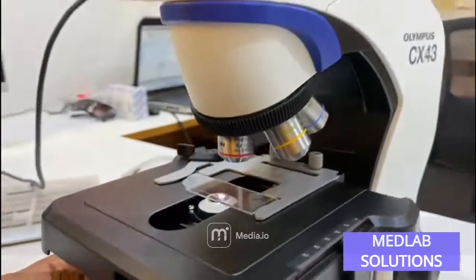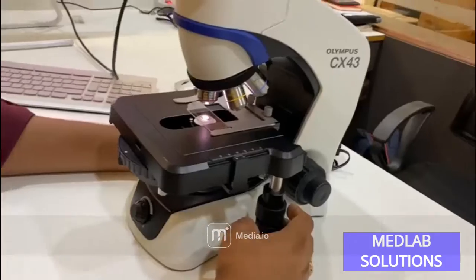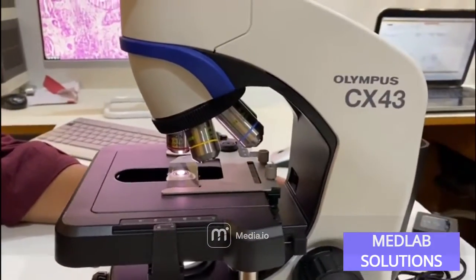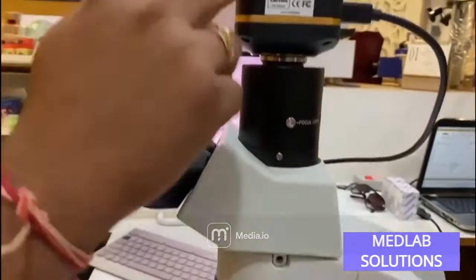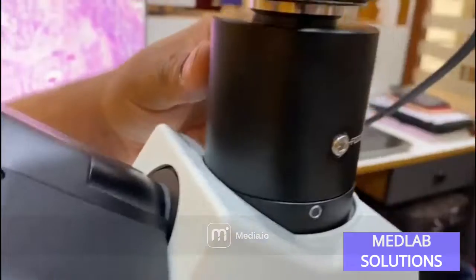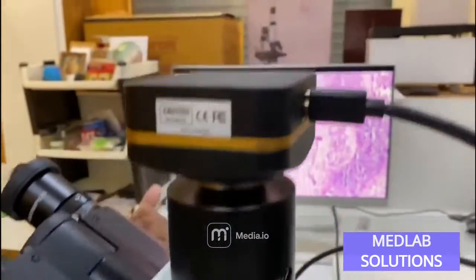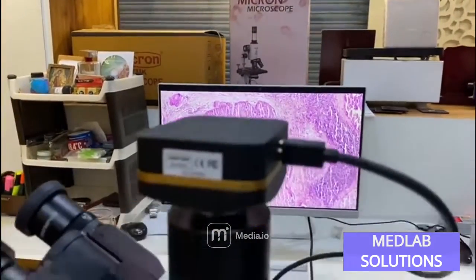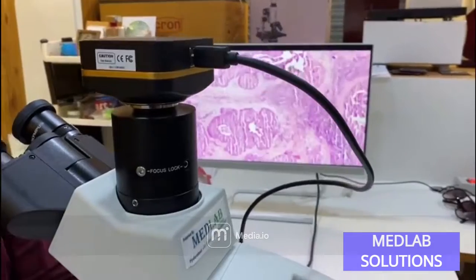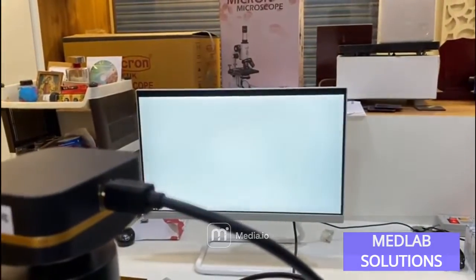These are all the features included in the CX43 Olympus Japanese brand microscope. We have mounted our 8-megapixel camera onto it using a 0.75x C-mount adapter, and synchronized the focus knob to the screen. You can simultaneously look inside the microscope and view live imaging on screen, and we can move from 10x to 40x to 100x with automatic light adjustment.